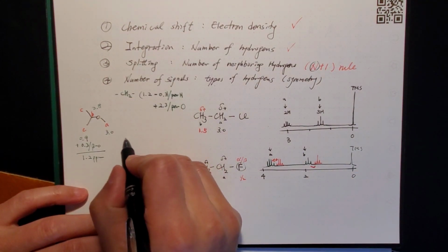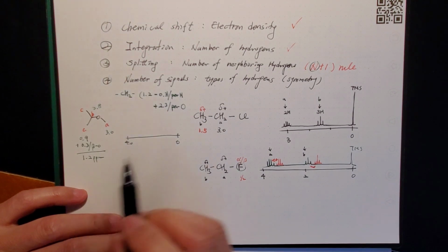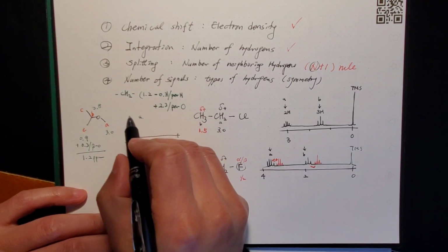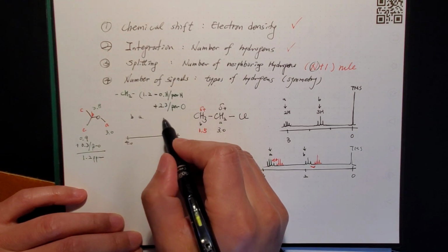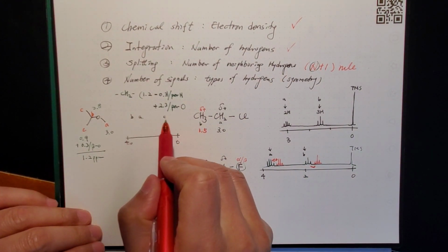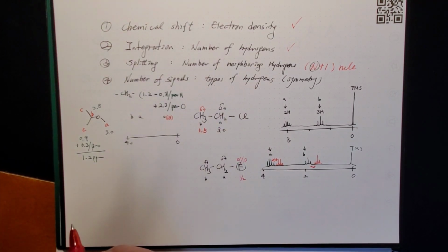All right then, so we are looking at 0 to about 4 ppm, and we are expecting A here around 3.0, and then B around 3.8, then about 1.2 we are expecting C. Then you know C has 6 hydrogens, so your integration, the number of hydrogens, should be 6 hydrogens.